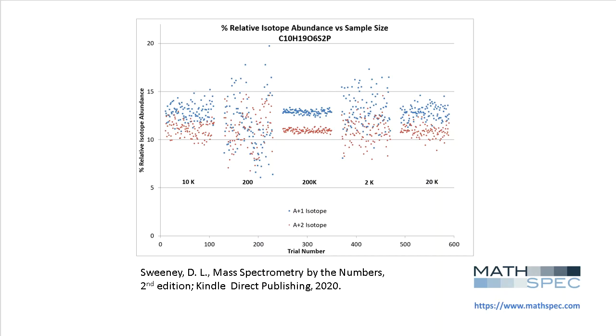The ratio of deuterium to hydrogen is not fixed. The deuterium-hydrogen ratio of the atmosphere on Mars is about 5 times greater than the same ratio on Earth. Because a fixed ratio is needed for this add-on, our add-on uses the most representative values from reference 1.